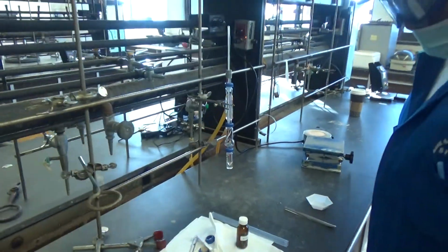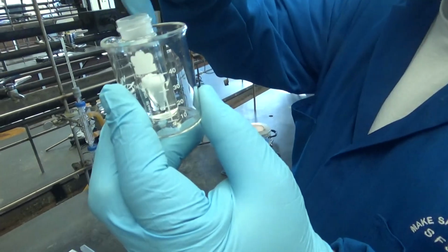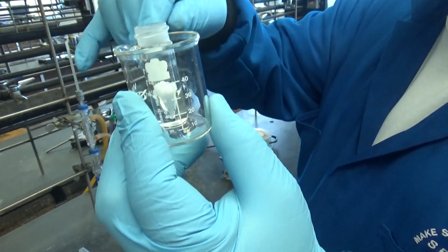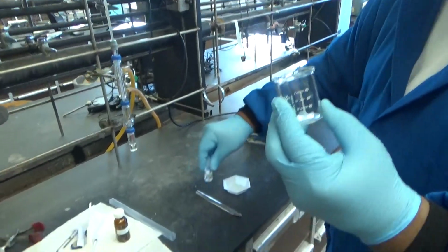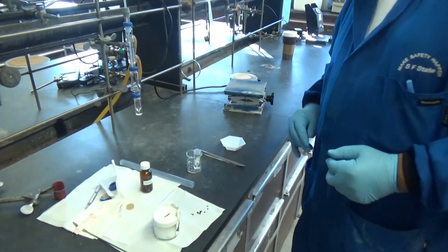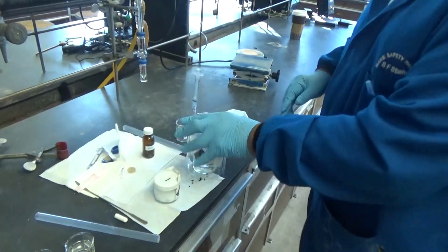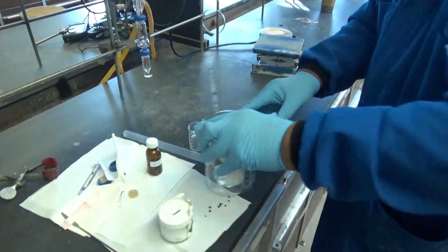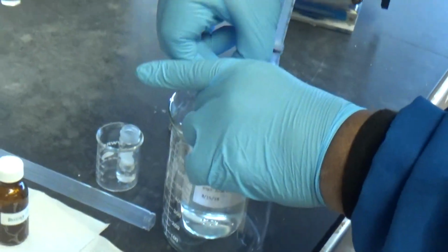All right. Now, you see the pinacol vial is in a beaker. That's to avoid technical mistakes, because if you leave that alone like that, you might bump it. Yeah, you don't want that. So it'll hold up in a beaker. Good idea. And you need to add 2 milliliters of 3 molar sulfuric acid. That'll help cause the reaction, I guess. It's an acid catalyst.